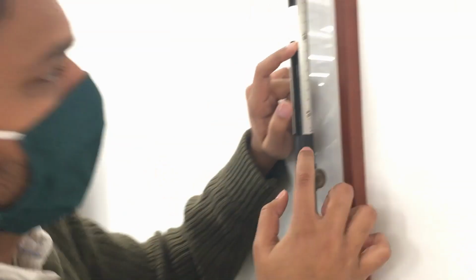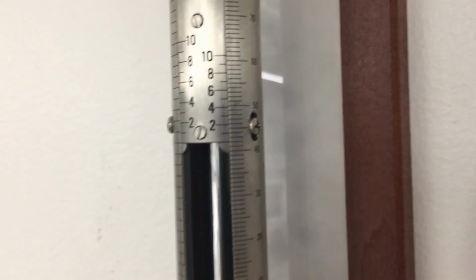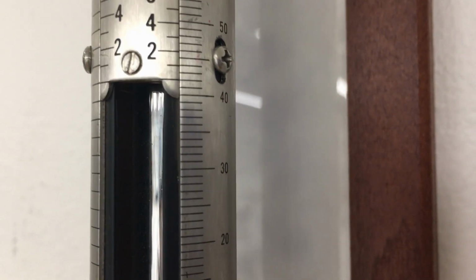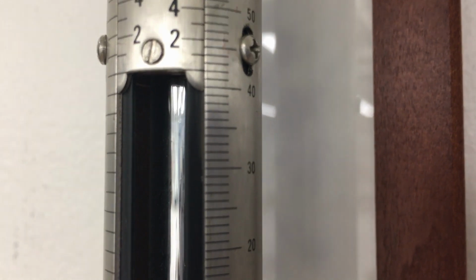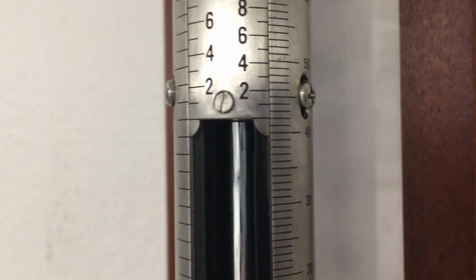All right, so now we found the pressure, which is P, and in PV equals nRT, our V, which is our volume, our mass of our volatile compound, and the temperature, which I took before removing it from the water bath each time. And we can use all of these to figure out the molecular mass or the molar mass of our volatile compound.